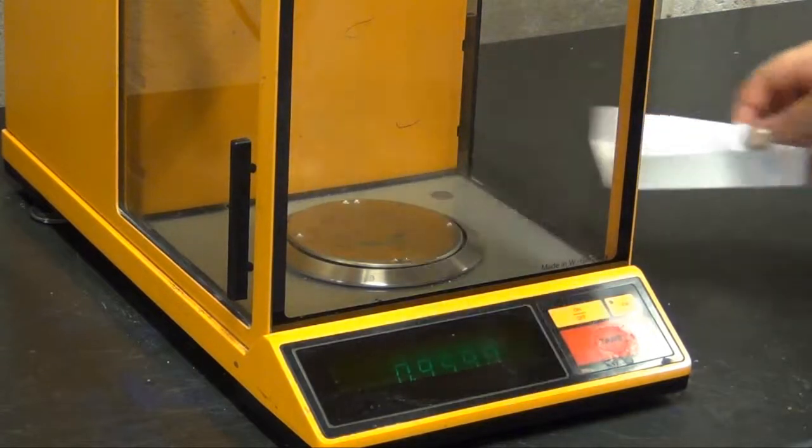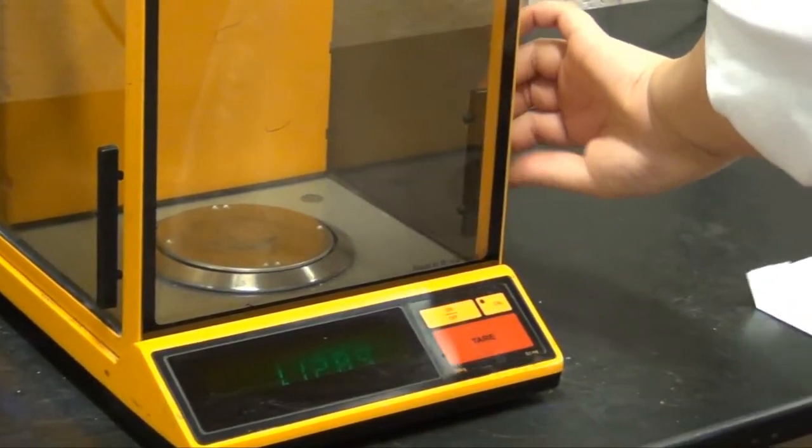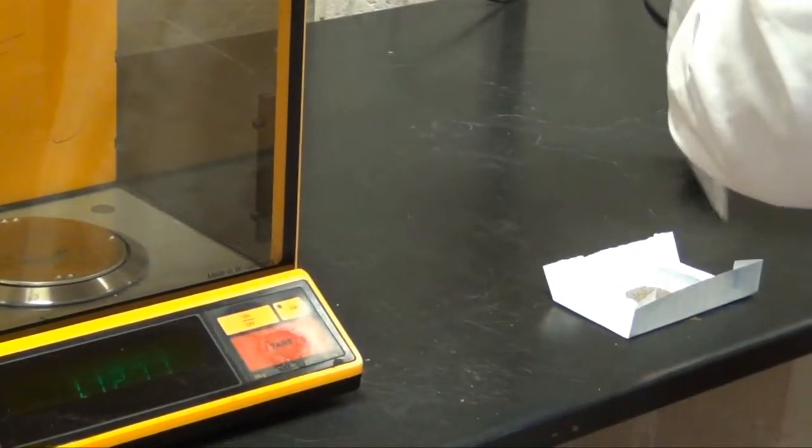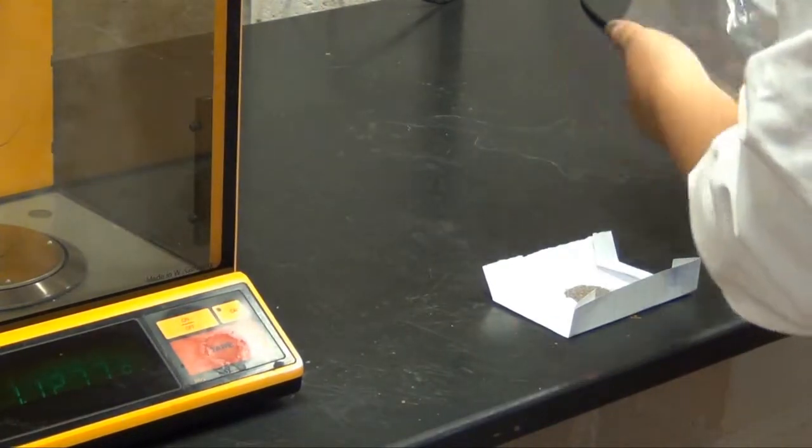So even for fine tuning of the final required sample weight, the boat must be removed.